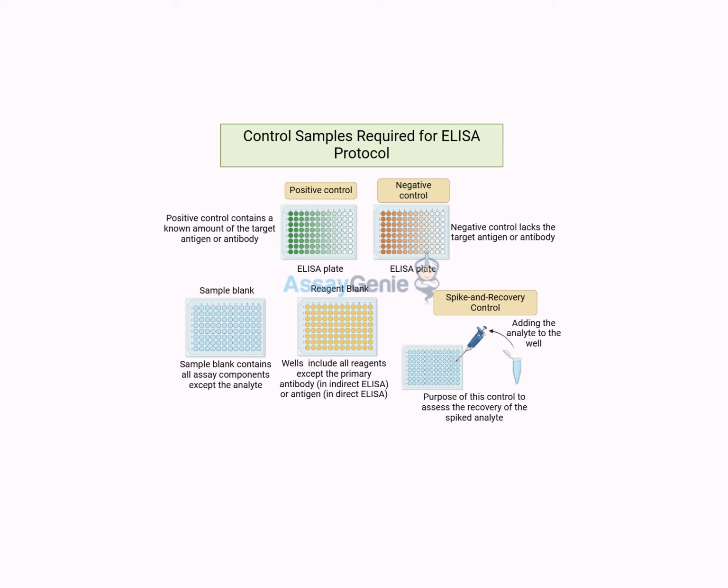Well, I think it starts with recognizing that those controls are tools, not rigid rules. We need to be really thoughtful about which controls are truly necessary for a particular experiment and which ones might be adding more burden than benefit. So it's about being strategic and selective with our controls rather than just throwing everything at the problem. Exactly. And it's also about being open to trying new approaches and not being afraid to question those established protocols. Sometimes a fresh perspective can lead to controls that are more efficient and effective, but still maintain that scientific rigor. Makes a lot of sense.